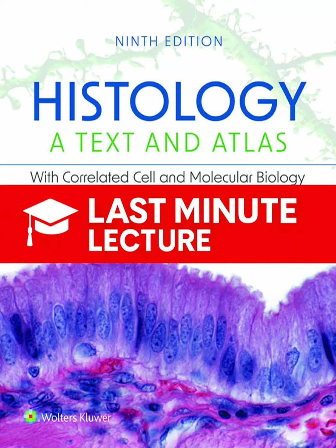This amplification also lets you visualize multiple different things in the same section at the same time, like in Figure 1.6. Figure 1.6 is a beautiful demonstration of that. You're looking at HeLa cells, where the microtubules are labeled in bright green and certain nuclear proteins are labeled in magenta, all on top of the blue DAPI-stained DNA. This kind of multi-channel image lets researchers study how different proteins are localized relative to each other with incredible confidence in detail.